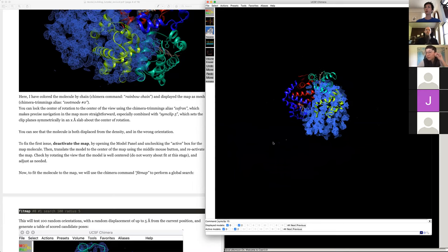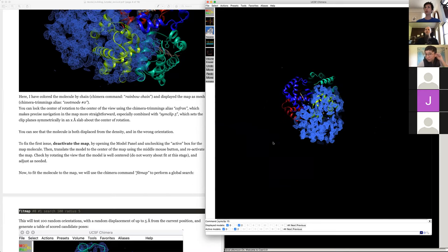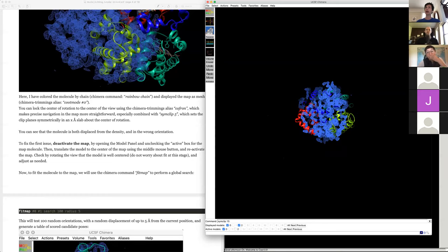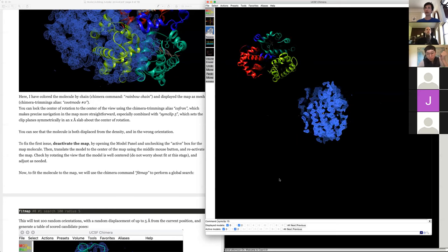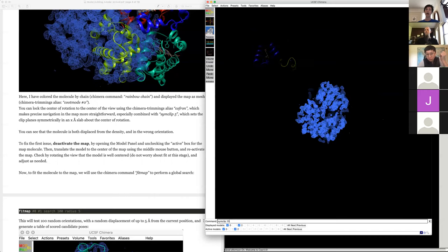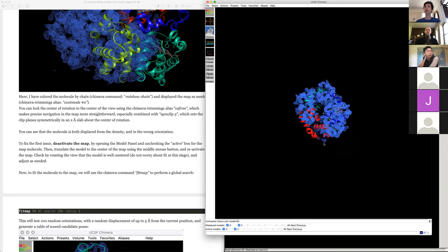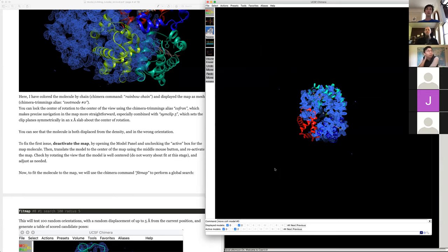Now we'll move the model to the center of the map. One way is to deactivate the map and move the model over approximately to position. Another way is to use 'move_ctr model 0' — this moves the current model to the center of rotation, which is convenient when you have lots of models and want to move one to exactly the right place.